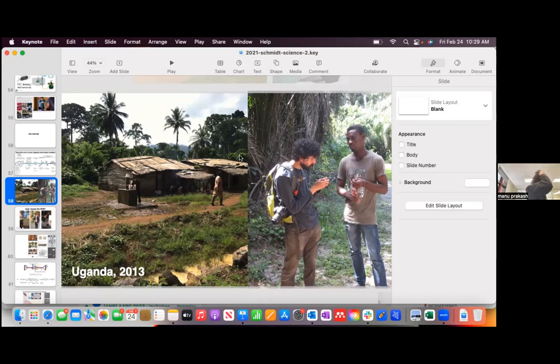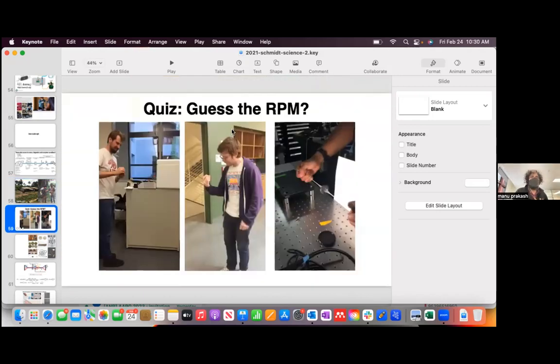And the question we asked is, there are lots of spinning toys that we're all used to playing with. I mean, does anybody have a fidget spinner in their bag? No, everybody knows what a fidget spinner is, right? Yeah, at least your generation. But there are lots of spinning toys. We started with yo-yos. Then we went through basically any sets of spinning toys, spinning tops, just thinking about whether there are ways to mechanically pump energy to get high enough centrifugation. That led to a lot of fun evenings in the lab.